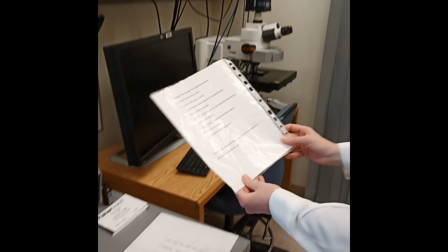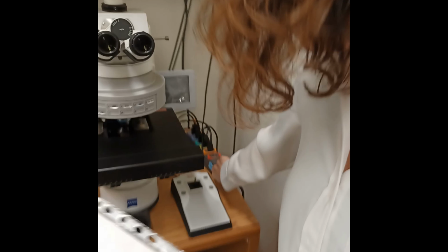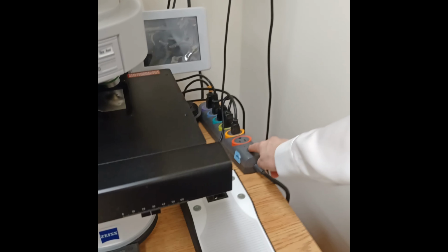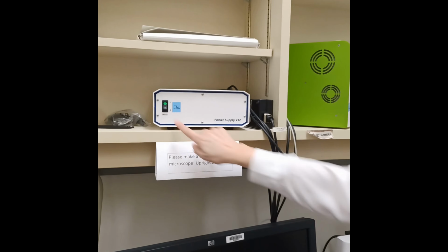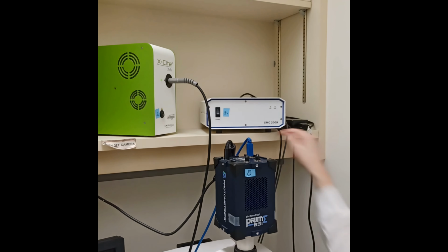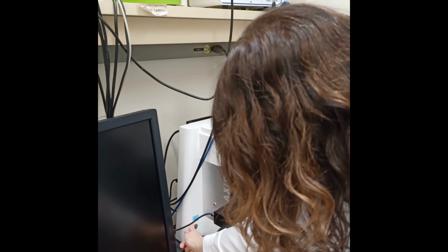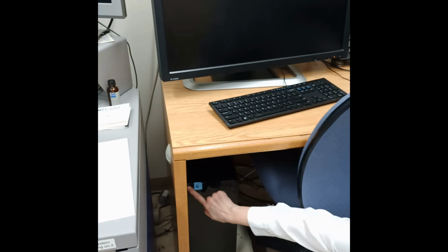As for all our imaging equipment, to start up the system, follow the provided instructions. First, push the button on the power bar to turn it on. Then, turn on the lamp X-Cite on the shelf above the scope. Flip switches 3A and 3B, also located on the same shelf. Next, turn on the microscope, then the camera, and finally the computer.